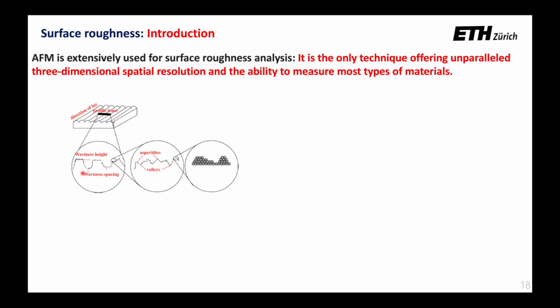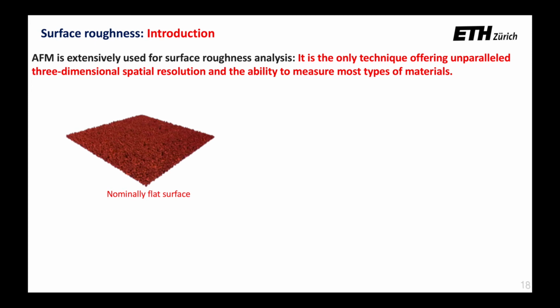So most real surfaces can have roughness over many length scales. Even when two thoroughly polished surfaces, what you can call nominally flat surfaces, come into contact, due to the existence of micro or nanoscale roughness, the actual contact occurs only at discrete points or asperities.